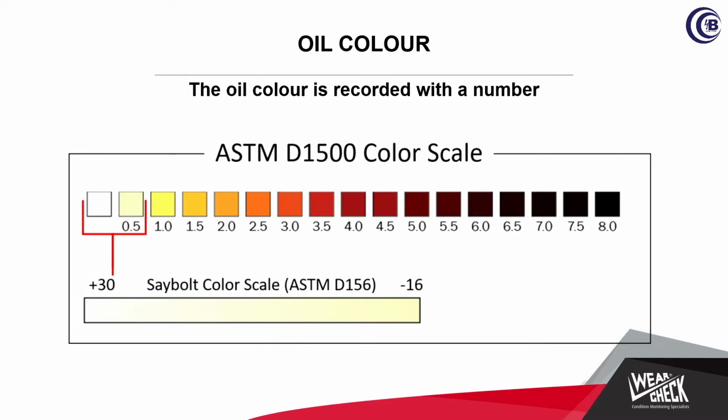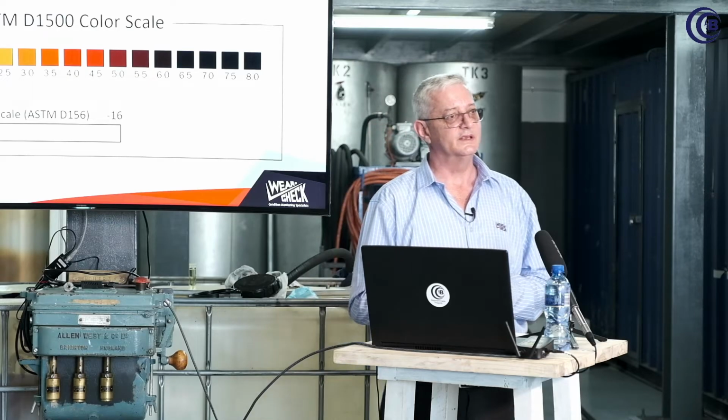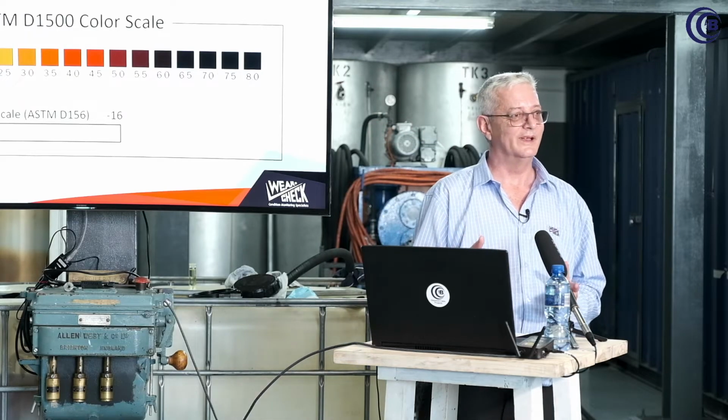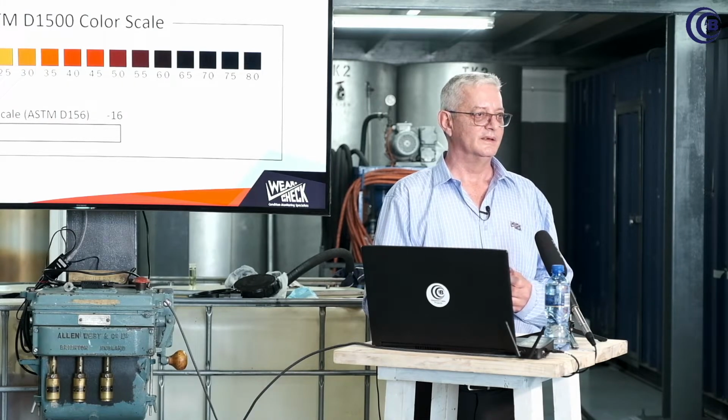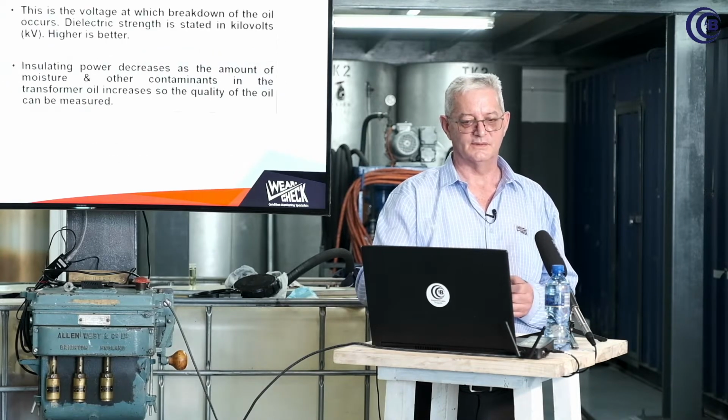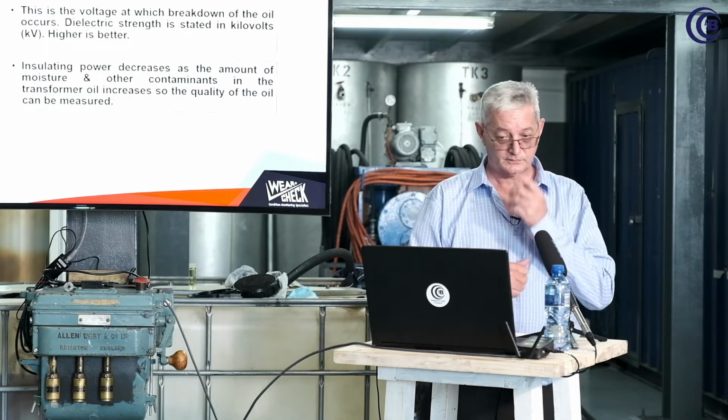But this is the standard that we're working towards in all the laboratories, that you get a color code, and then you are also not reliant on a person. For me, an amber, and for the next person, an amber color might be different. So it's just better to standardize on a number, although it's difficult now for some clients. They see a number, let's say 2. What color is 2 if they don't have the chart? So there are some advantages and disadvantages to it as well.